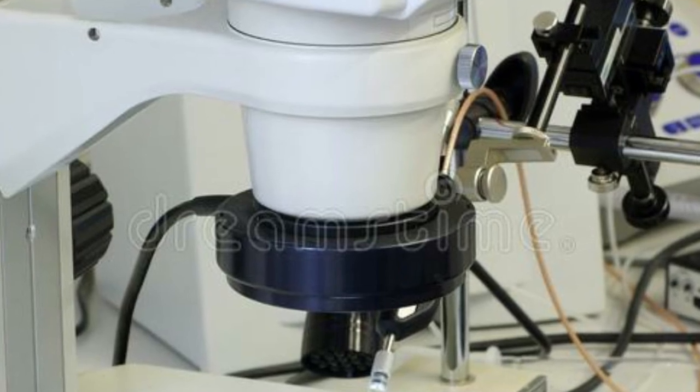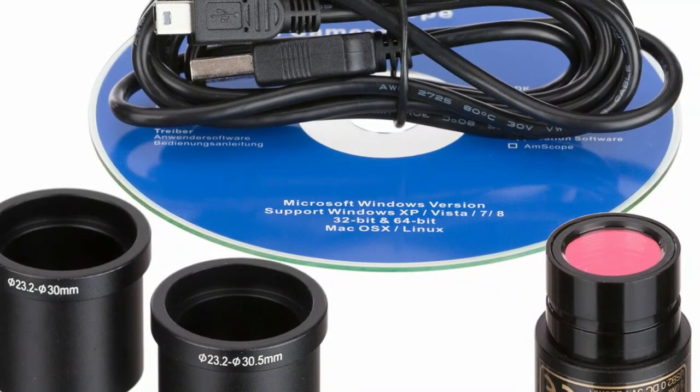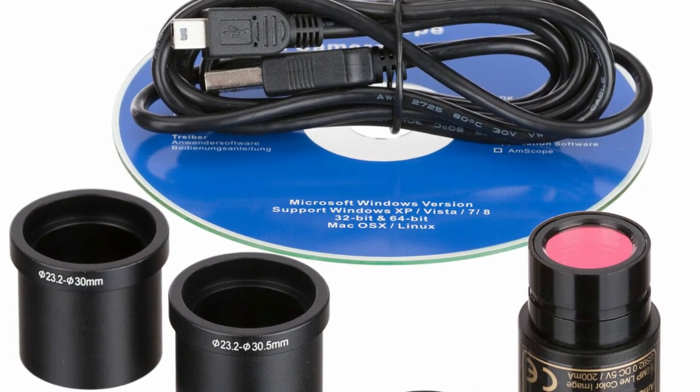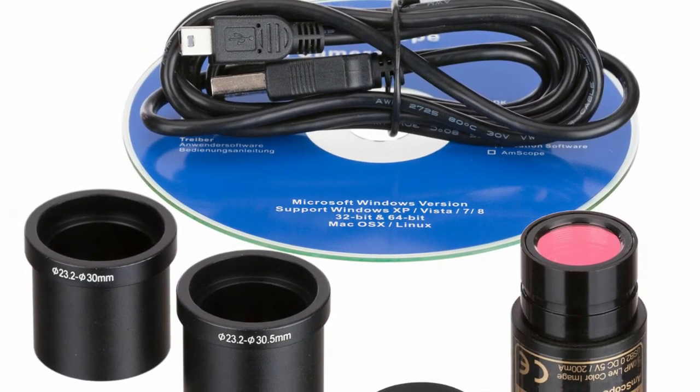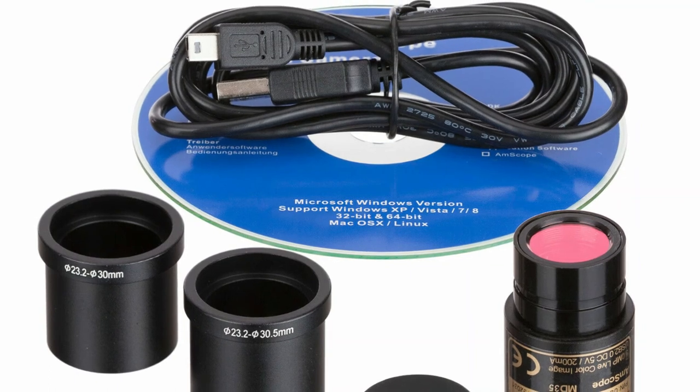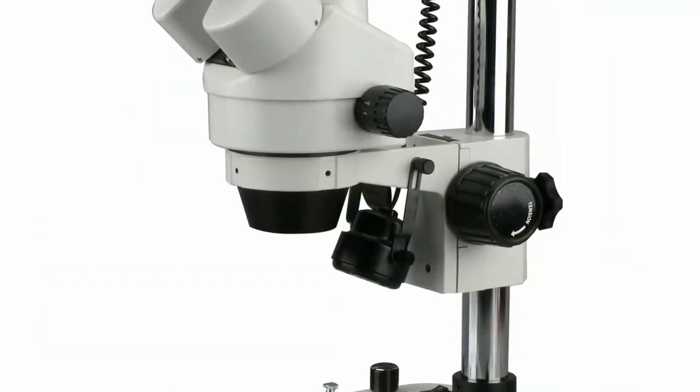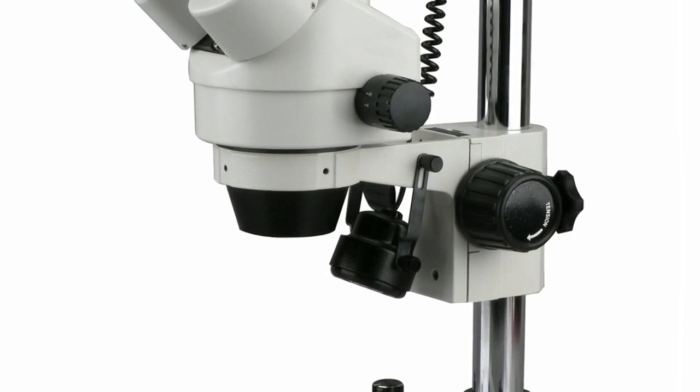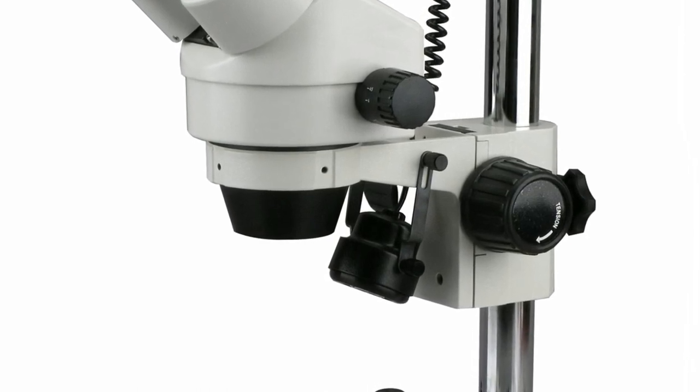Transmitted illumination serves to observe slides given that light is passed through the specimen. The stage of this microscope has a frosted stage plate for use with lower transmitted lighting as well as a reversible black and white plate that will provide contrast with both light and dark colored specimens when used with upper reflected lighting.